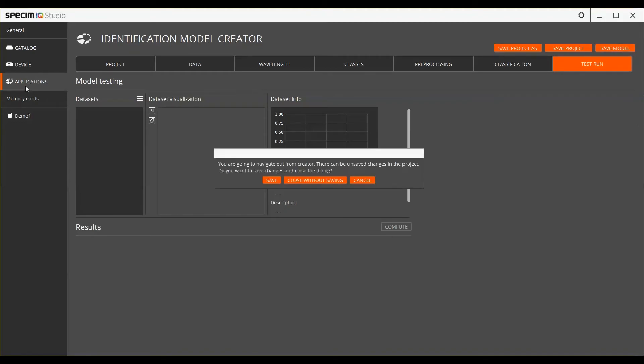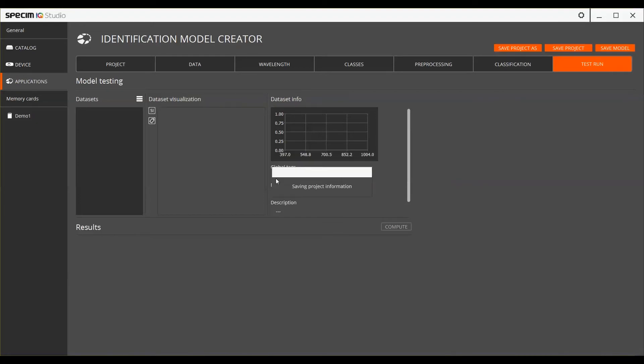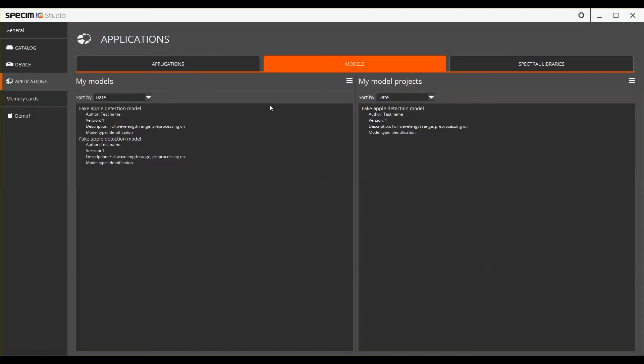A saved model then appears to the list of ready models. Ready models can be used in applications.